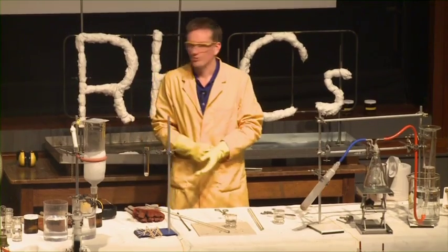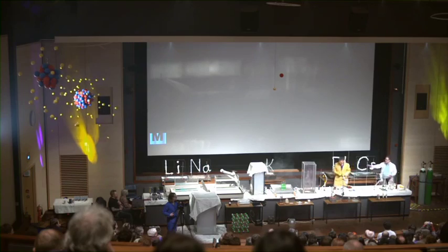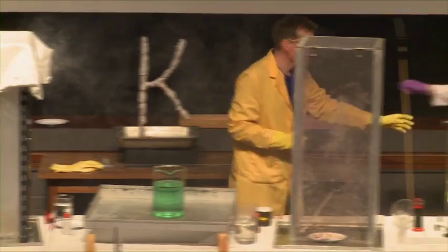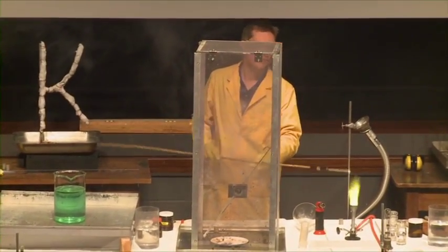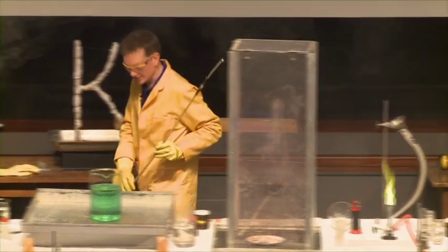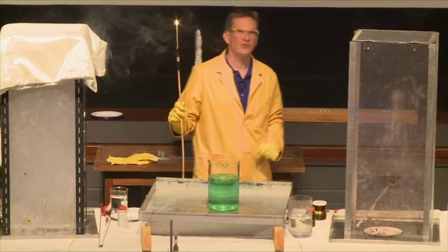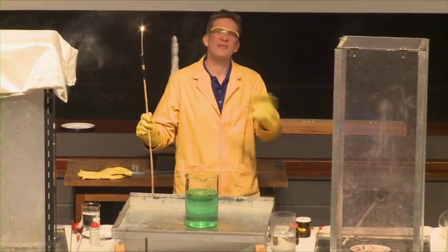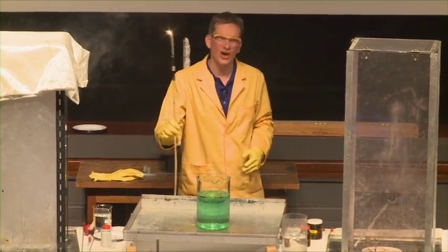One of the reactions we've seen is the generation of hydrogen gas, which is of course at the top of Group 1. We're going to go out with a bit of a bang now. How can we combine what we've learnt? Well, we've seen that sodium hydride reacts with water to produce hydrogen gas. We've seen that potassium superoxide reacts with water to give us oxygen gas. So maybe if we mix the two together, we get a mixture of hydrogen and oxygen — and that should go with a nice loud bang.